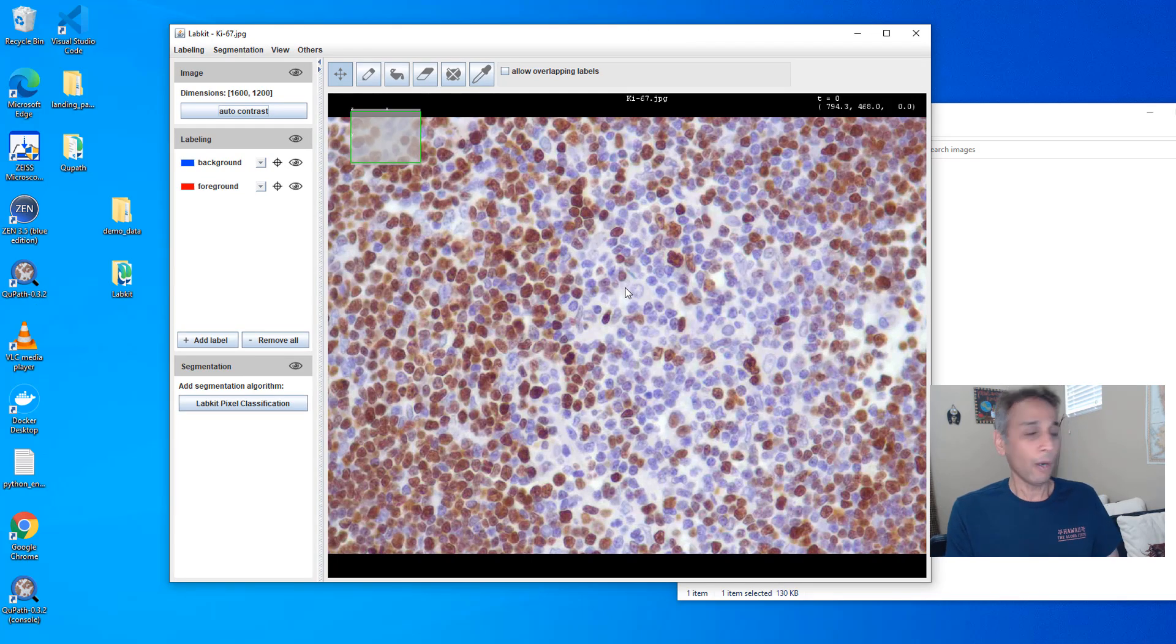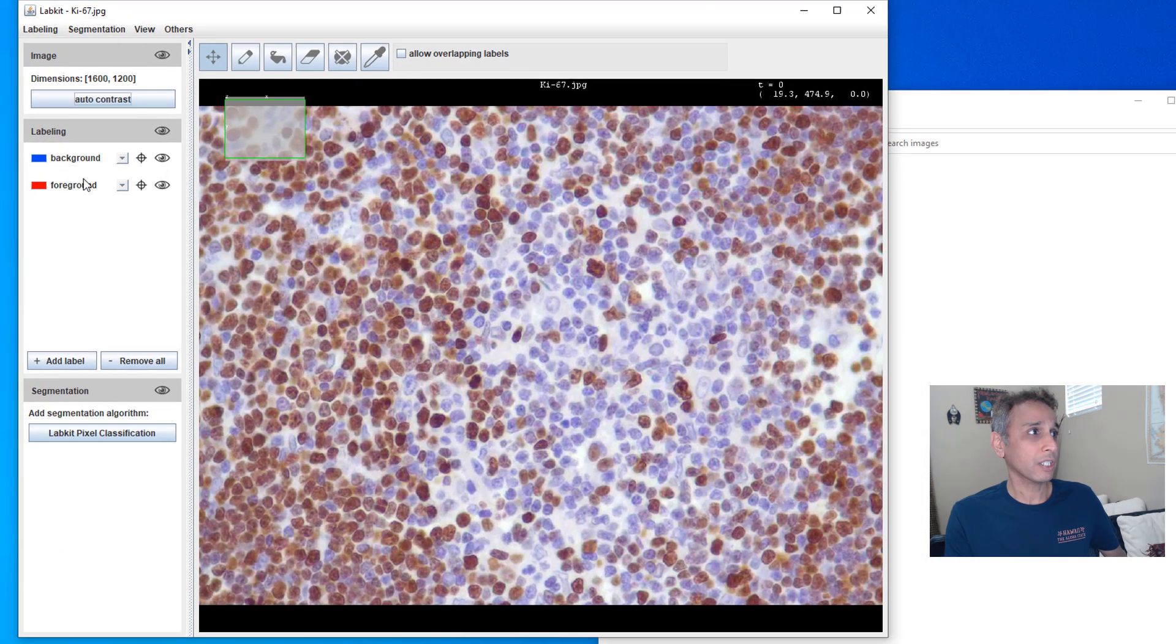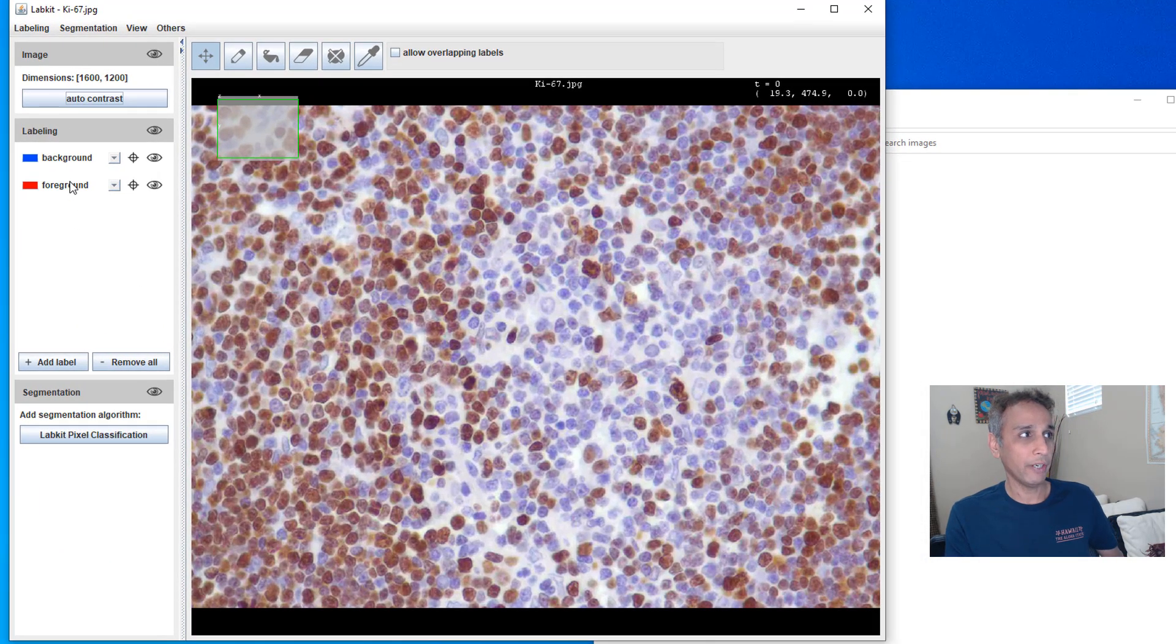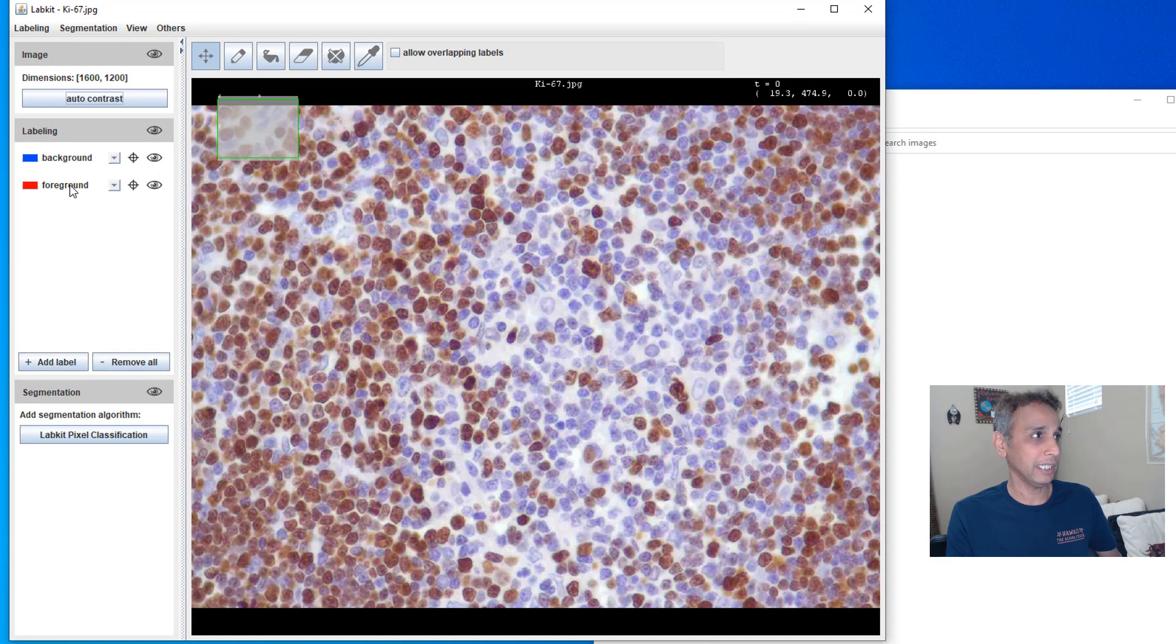Okay, now what? It by default starts with the background and foreground. In this case you can basically, let's say, change the name.